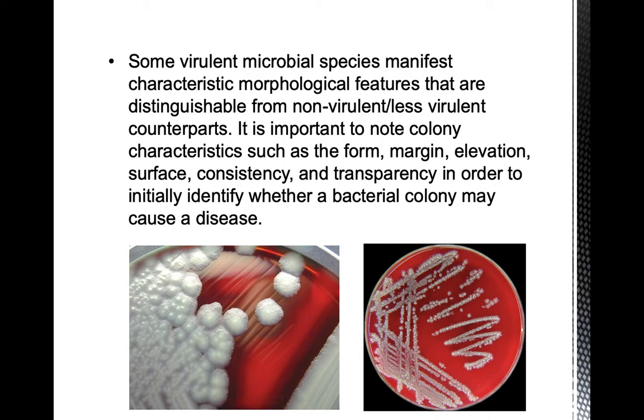Now, in this activity in module 5, our main focus is to learn how we can characterize, how we can describe microbial colonies, bacterial colonies, those colonies that are isolated from the laboratory environment and from the human body. Why is this task very important?